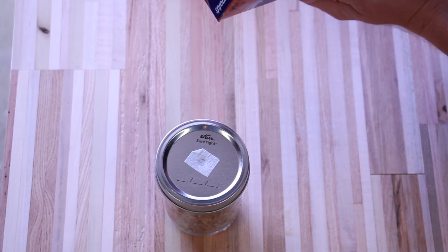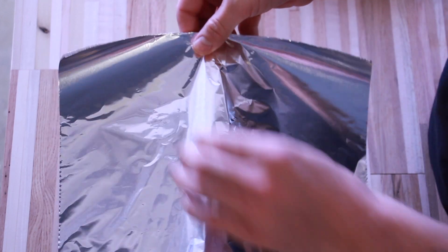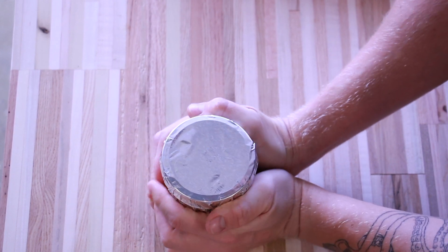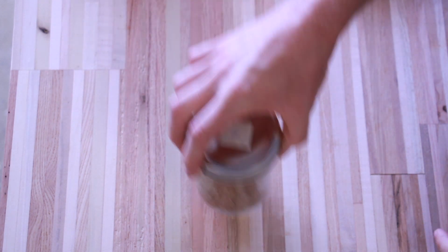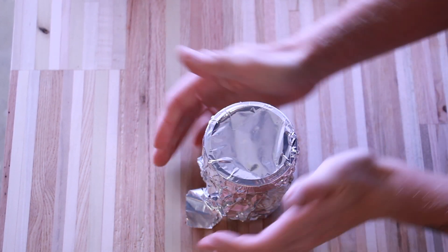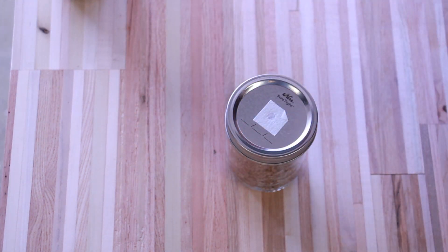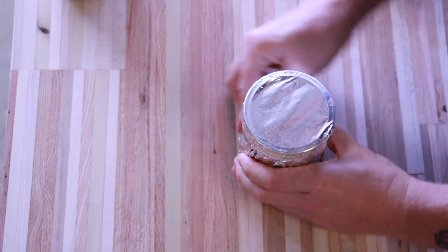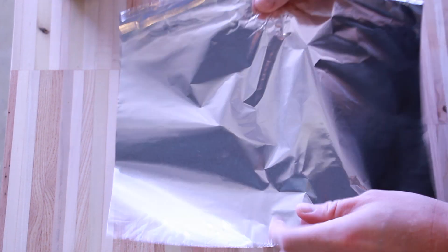Cover the caps of your jars with aluminum foil. This will prevent water from entering the jars when you are sterilizing them in your pressure cooker. We want our grain to be just as moist as it is right now, without adding more moisture during the pressure cooking process. You'll want to establish somewhat of a seal with the aluminum foil over the lids, but it doesn't have to be perfect.